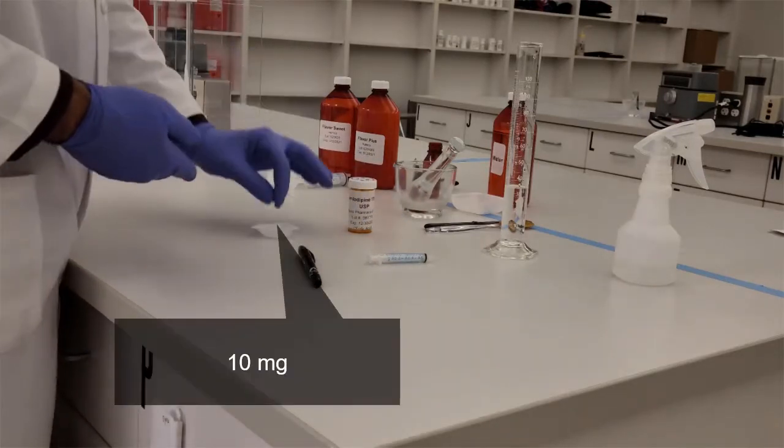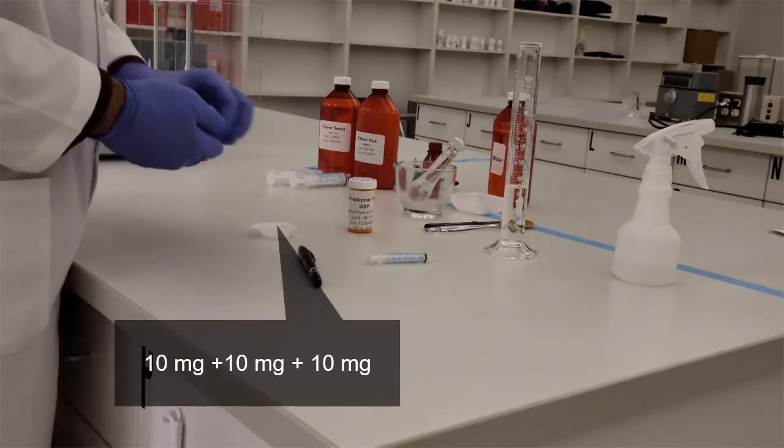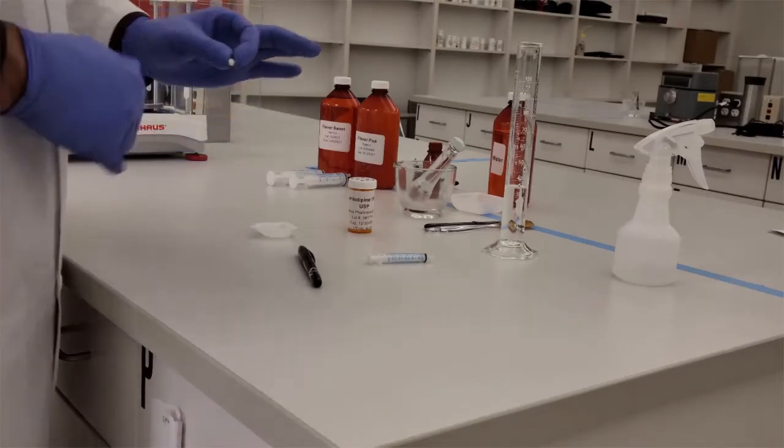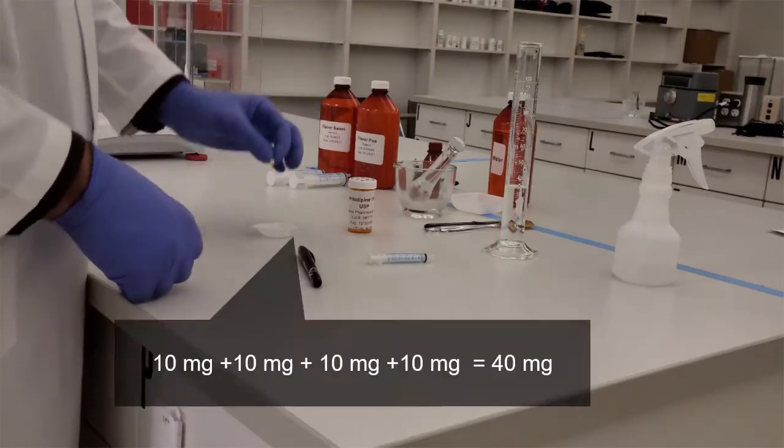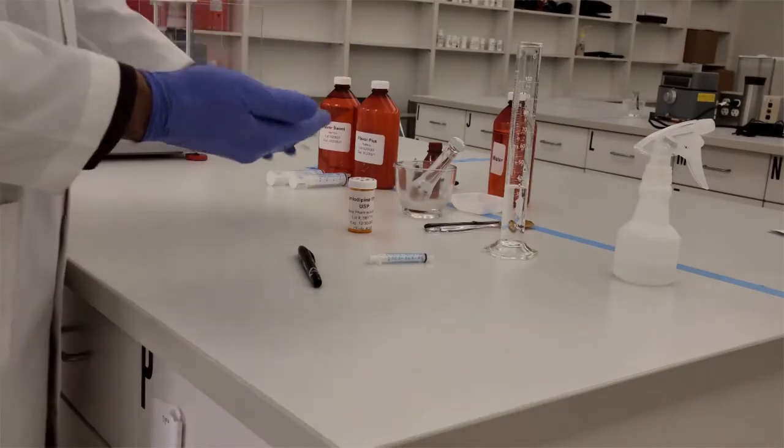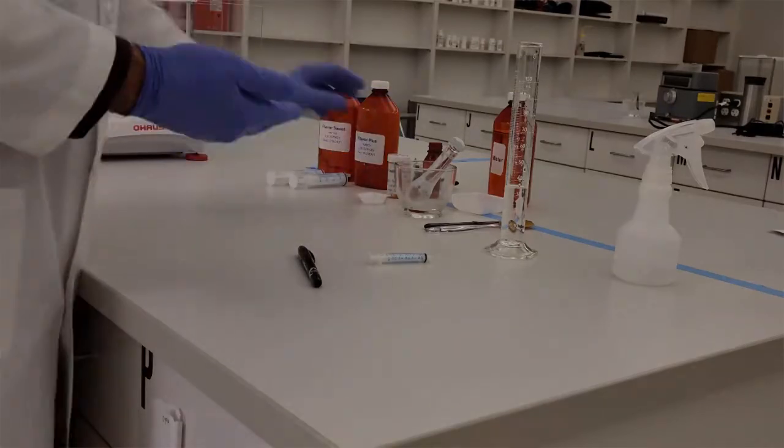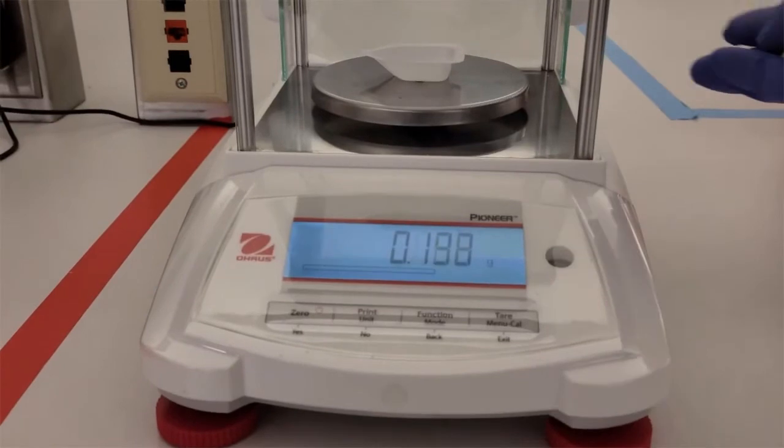So how am I going to get 35 milligrams? Well, if I take one tablet, I've got 10 milligrams. Two tablets, I got 20. Three, I got 30. And now I need 35. So I can split that tablet in half, and I can get that, but that's a little less appropriate. What I'm going to do is actually put four tablets, which contains 40 milligrams of drug, and I'm going to weigh all four of those tablets.